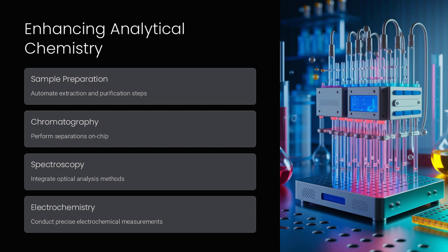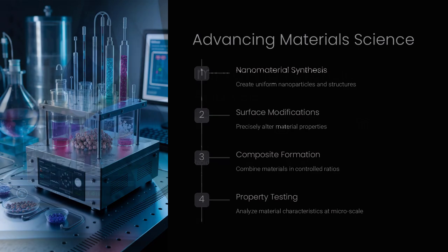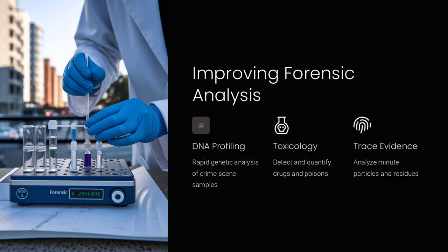Digital microfluidics is transforming laboratory automation by harnessing the power of reconfigurable droplet platforms to carry out complex workflows with unprecedented precision and flexibility. At its core, this technology uses electrical signals to manipulate tiny droplets on an array of electrodes. These droplets can be precisely moved, merged, split, and mixed on a flat surface, enabling a wide range of chemical and biological reactions to occur in a controlled automation. This reconfigurability means that a single device can perform multiple tasks, adapting dynamically to the needs of different experiments or diagnostic tests.